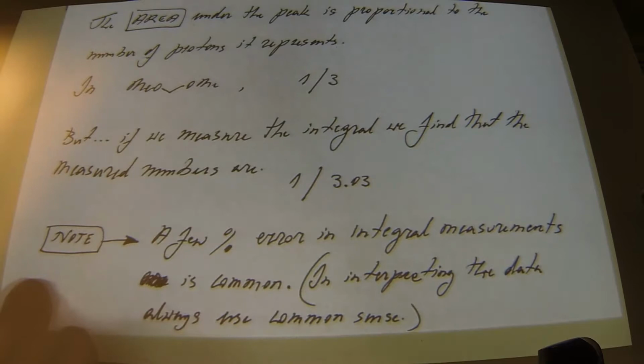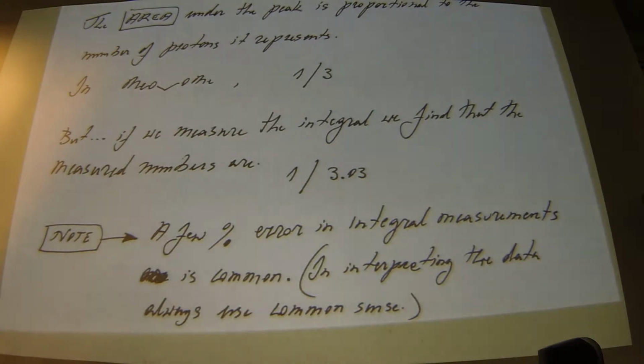And usually you can figure it out from other information. It's not that hard. Why? Because the ratios of the protons have to come out to something real. In other words, if you have 3 carbon atoms and you run the ratios and it turns out you've got 20 protons, obviously that can't be, right? There's no way to attach 20 protons to 3 carbon atoms without doing real violence to the octet rule.